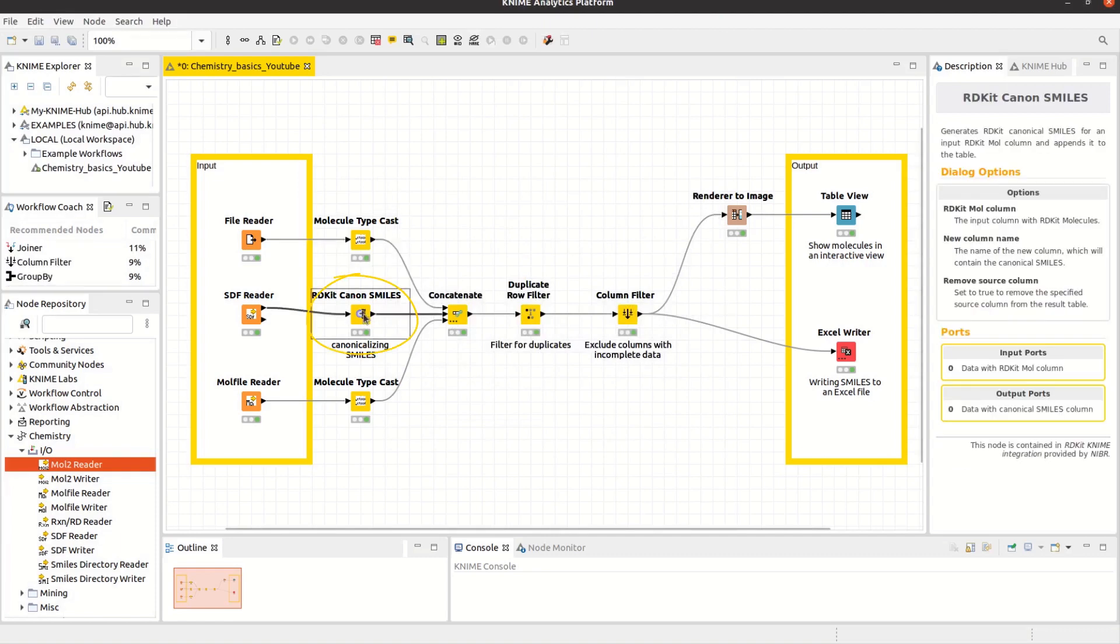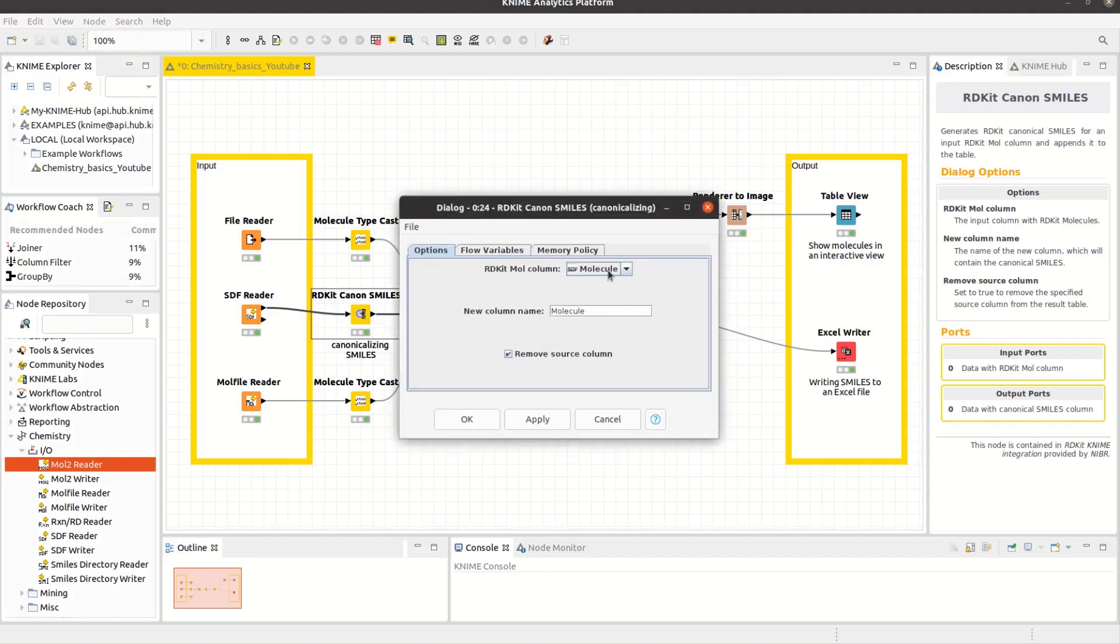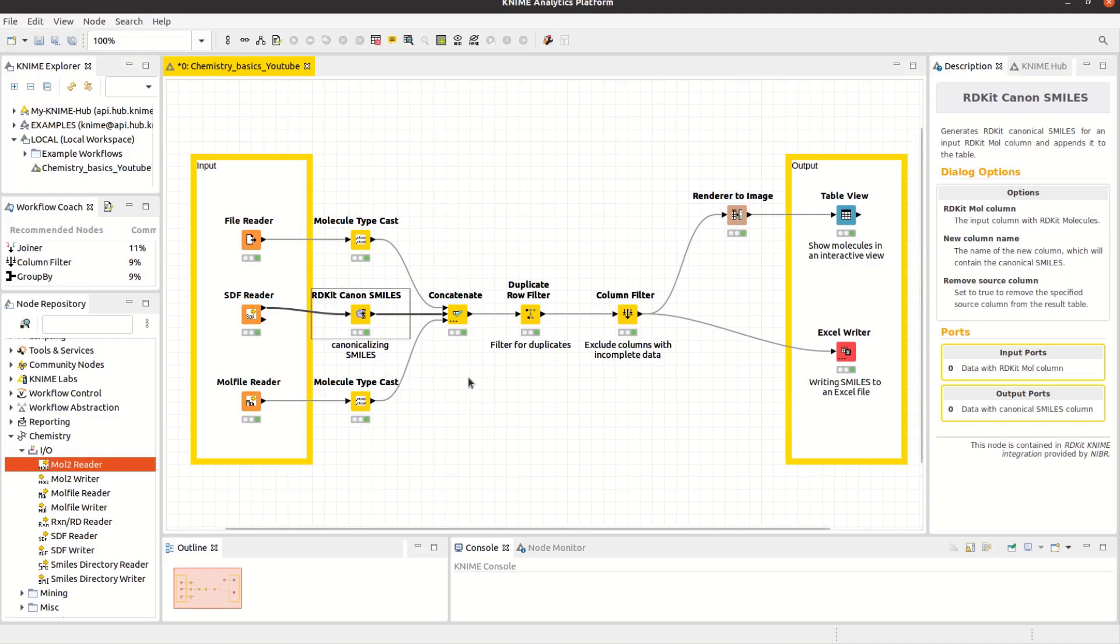The RDKit Canon SMILES node generates Canonical SMILES for an input mole column. Canonical SMILES gives a single canonical form for any particular molecule. You may want to use this node if you have different SMILES for the same molecule and bring that into a uniform format.